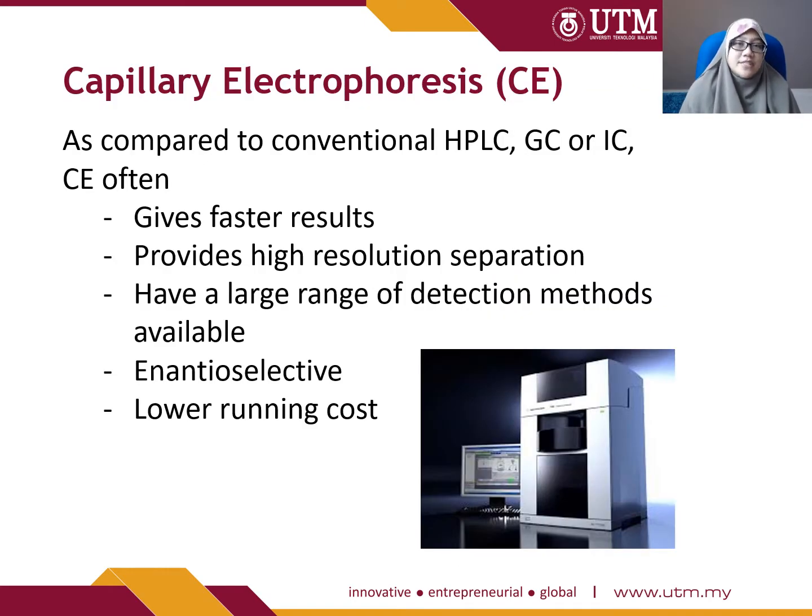Capillary electrophoresis, as you know, is one of the separation methods available other than HPLC, GC or IC. Okay, memang tahu kan HPLC apa, GC apa, IC tu apa. Dalam bidang forensik, usually people will utamakan HPLC, GC or IC.